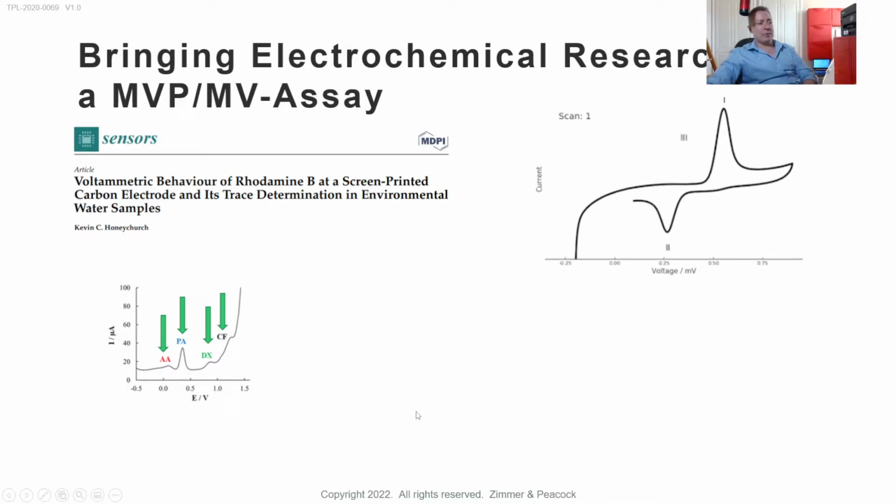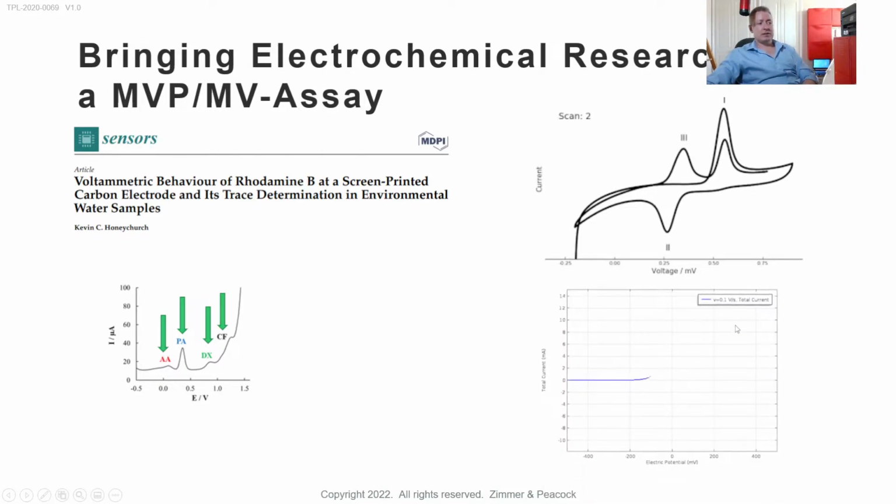Now as I say, the voltammetry that they're using here is DPV. This is the voltammetry of an organic molecule, and it's very distinctive. This is the voltammetry from an organometallic compound, and its voltammetry is also distinctive. The reason I want to step away and say is, let's not treat this as voltammetry, let's treat these as fingerprints.